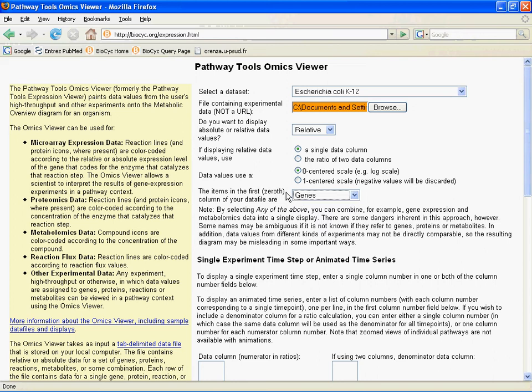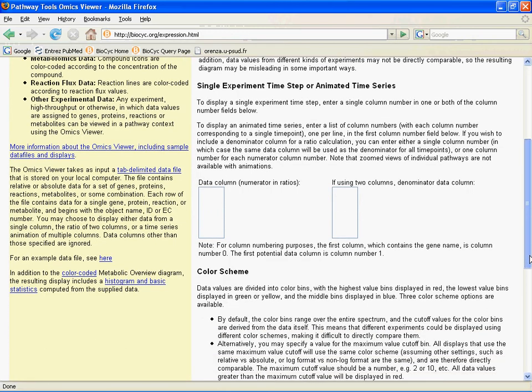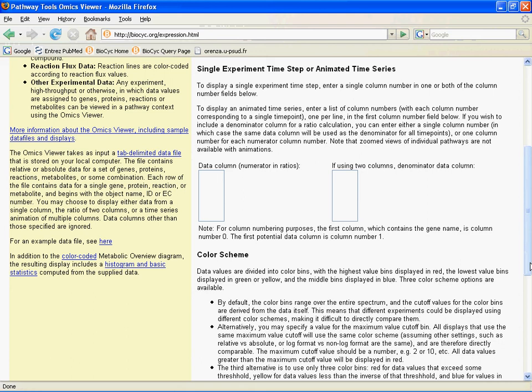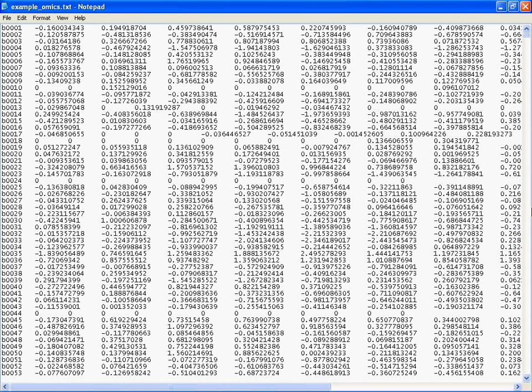Notice it says the items in the zeroth column. One feature of this software is that columns are numbered starting at 0, so what you might think of as the first column in your data set is really column 0. Going back to look at the data set: column 0 holds the gene identifiers, column 1 is the first time point, column 2 is the second time point, column 3 is the third time point, and so on. I find this incredibly handy — it maps directly to time points 1, 2, 3, etc. Just remember this when selecting individual columns to display.